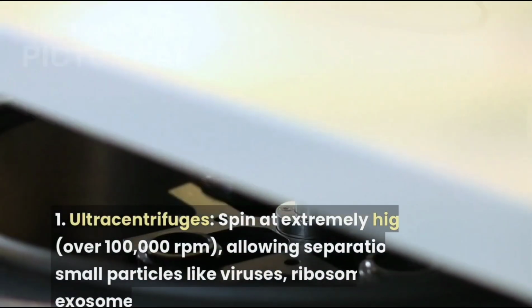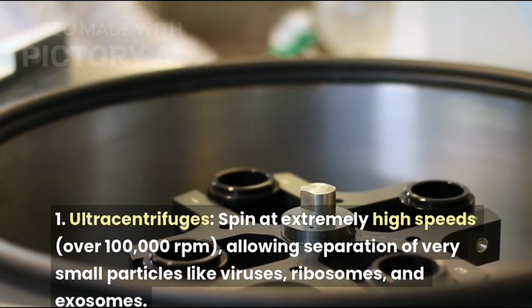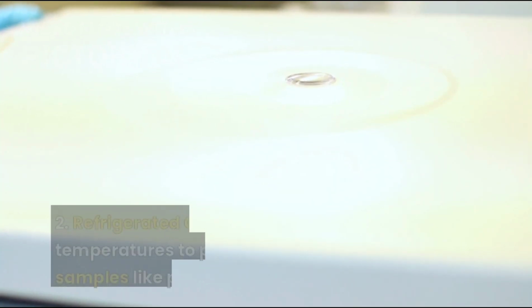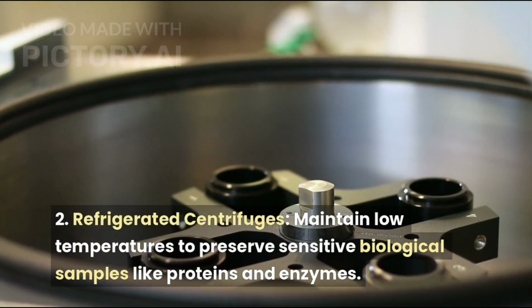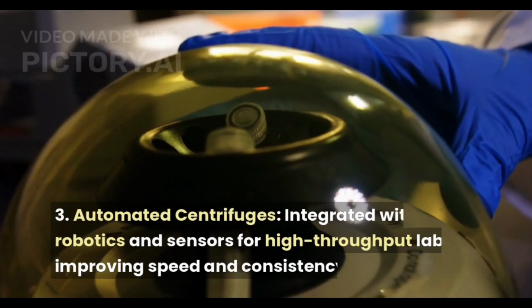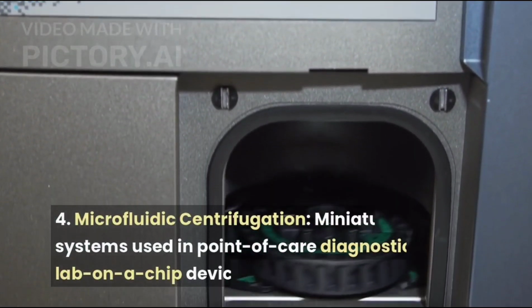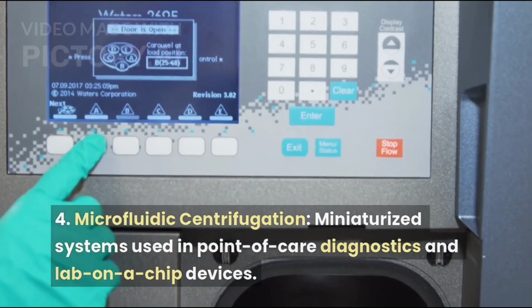Number 1, ultracentrifuges, spin at extremely high speeds over 100,000 RPM, allowing separation of very small particles like viruses, ribosomes, and exosomes. Number 2, refrigerated centrifuges, maintain low temperatures to preserve sensitive biological samples like proteins and enzymes. Number 3, automated centrifuges, integrated with robotics and sensors for high throughput labs, improving speed and consistency. Number 4, microfluidic centrifugation, miniaturized systems used in point-of-care diagnostics and lab-on-a-chip devices.